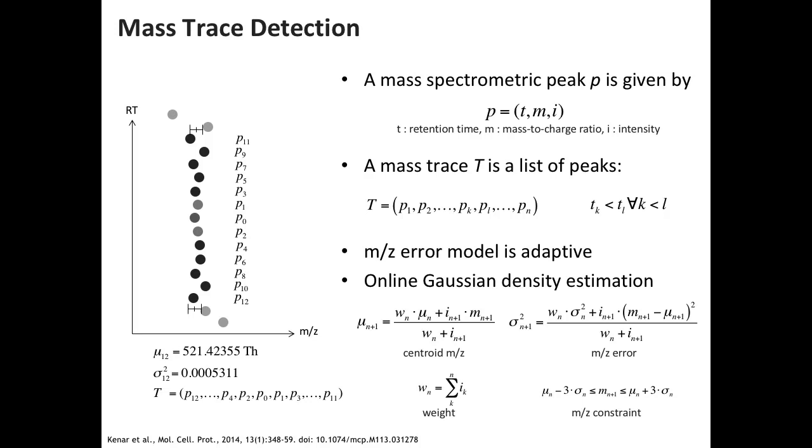Yeah? And that's sort of the beauty of that, because you end up with a mass trace where you know exactly what it means, and where this abort criterion is basically intrinsically defined by the data. And that makes it very robust. When you start with this error window, it doesn't matter whether you start with 1 ppm or 2 ppm. It just has to be a decent estimate. If it's too narrow, then that's not a good idea. But if you're off by a factor of 2, it doesn't really matter. It will still end up with more or less the same mass trace because it estimates this error on the go. It just needs a decent starting value.